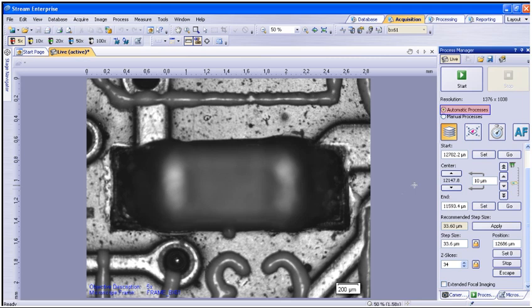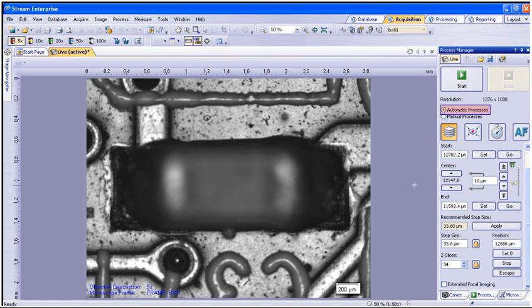The automatic processes contain EFI, extended focal image, MIA, multiple image alignment, time lapse imaging, and the software autofocus function. The automatic processes are available in Stream Motion or Enterprise.